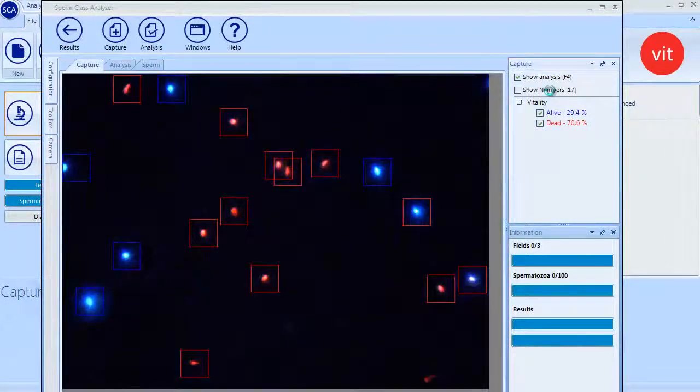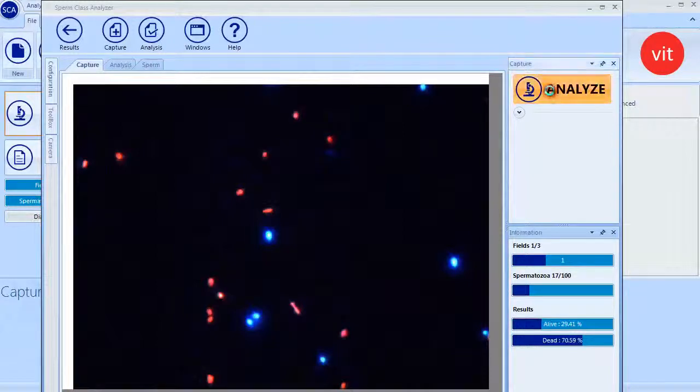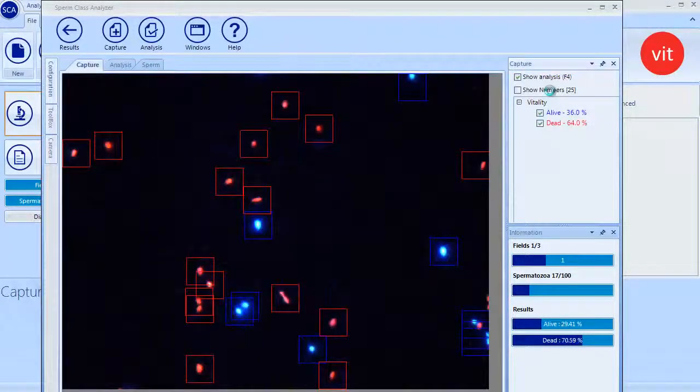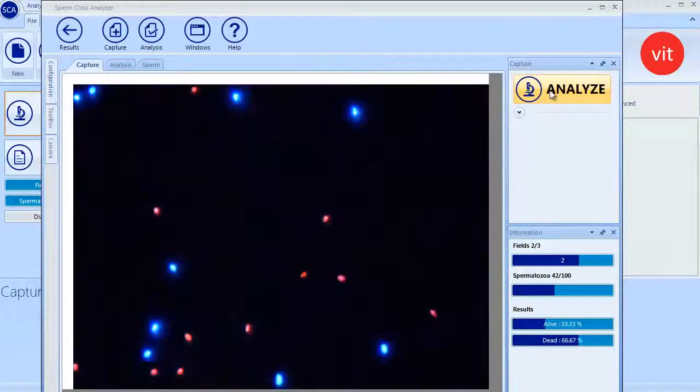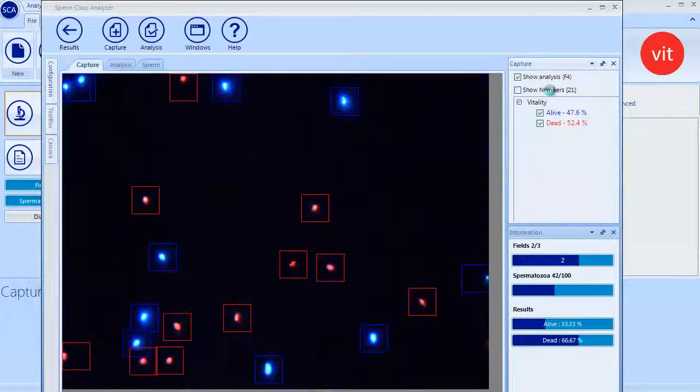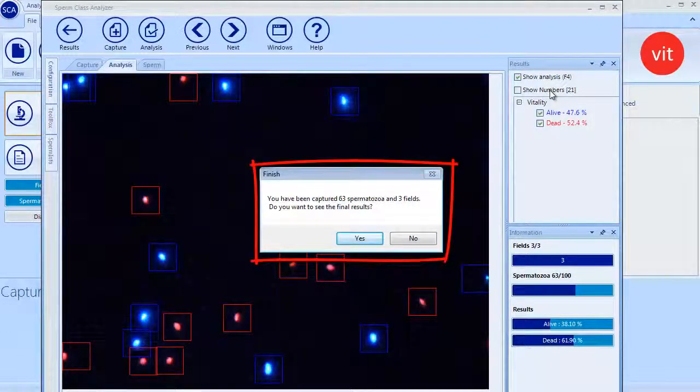Focus the field and analyze it by clicking again the Analyze button. Fields are captured and analyzed automatically. Once the desired number of spermatozoa is analyzed, the following message is displayed.